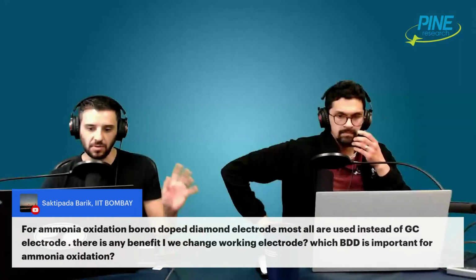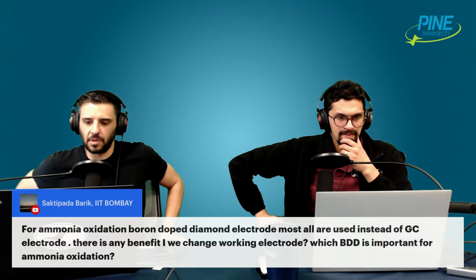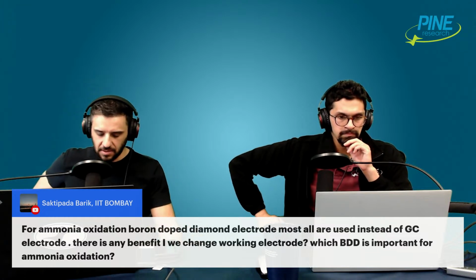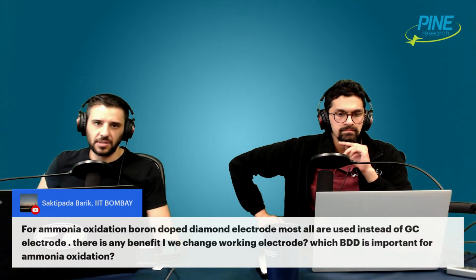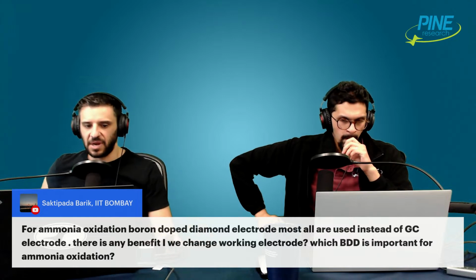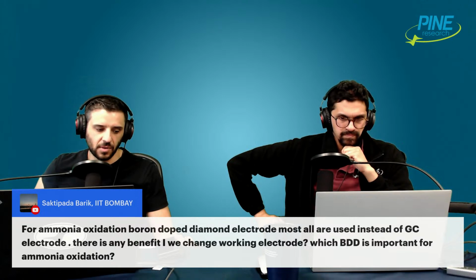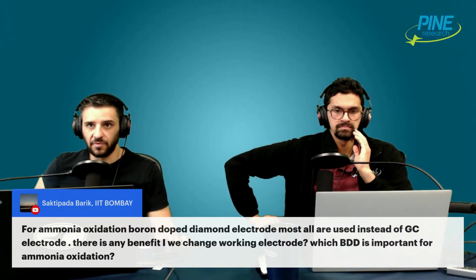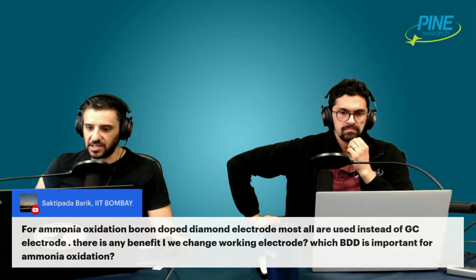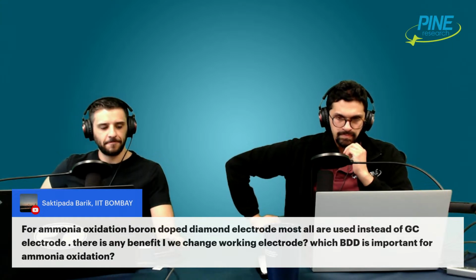Now, as it relates to ammonia oxidation specifically, I don't know. I don't have a lot of experience with ammonia oxidation, what potential it happens at, whether it needs more or less background current, or how heavily affected it is by those things. But what I've told you is my knowledge of why BDD is used in place of glassy carbon. So I would assume some or all of what I just mentioned plays into why it's preferred for ammonia oxidation, but I don't know a lot more specifically than that.